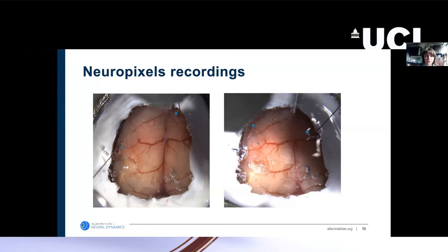Here are some examples of recordings from a mouse implanted with this technique. We can insert the Neuropixels probes right through the Duragel — it's very soft and doesn't hinder the insertion at all. Because we also use a cap to protect the Duragel when the mouse is not being recorded from, the Duragel lasts a very long time and the brain stays very healthy. We often perform the implantation about a month before recording, and the brain stays in very good health over that period. We usually don't have any problems penetrating the surface with the Neuropixels probes even after such a long time.